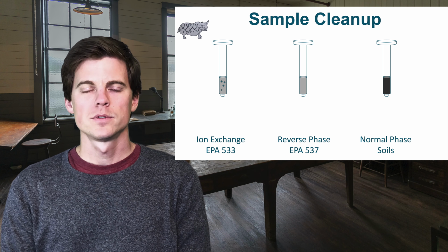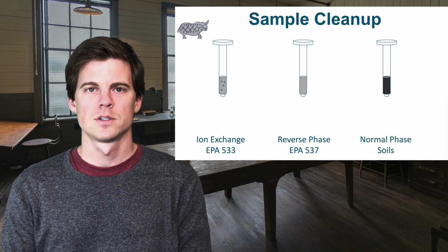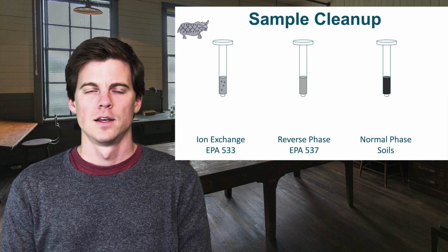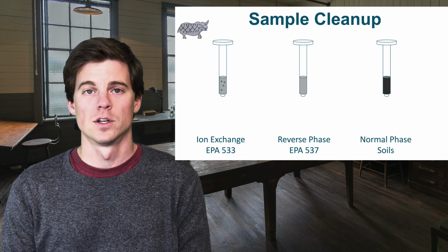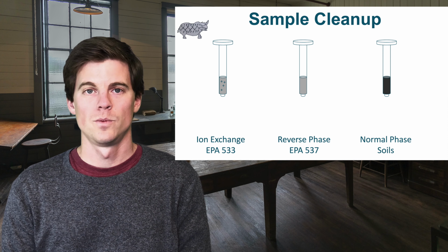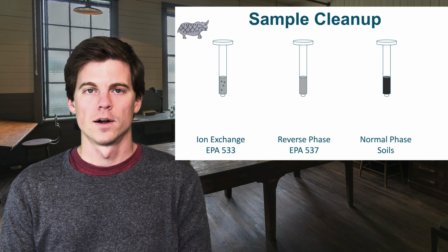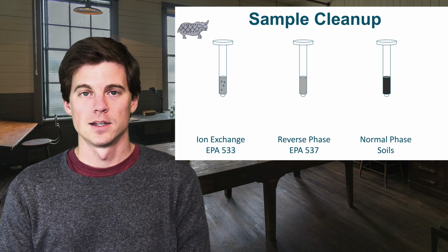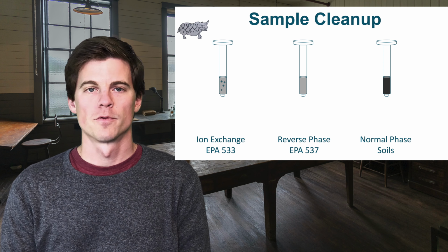With water samples and with other aqueous PFAS solutions, it becomes a little more complicated. Methanol mixes just fine with water, so if we add it to water, all we've done is dilute it. So when we have something like PFAS in water, we can use 3 different mechanisms, and there are different methods that use these or require these. The first one is pretty cool.